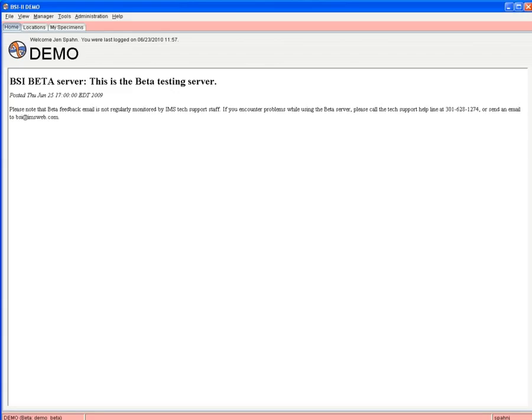Participants are muted, and I will address questions at the end after the demonstration. These changes are made for users in our small labs, but may be helpful for everyone. The intent was that users for most tasks wouldn't have to work outside of the EZ interface, the locations in My Specimens tabs.